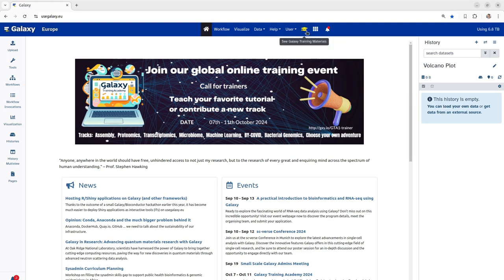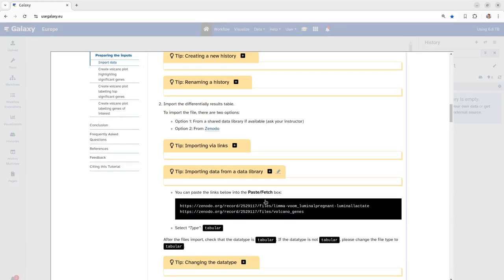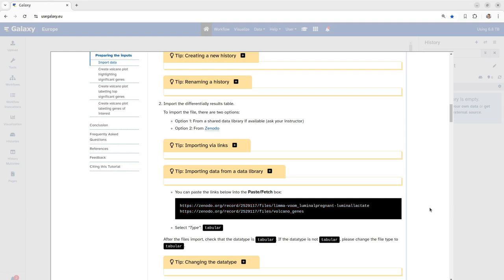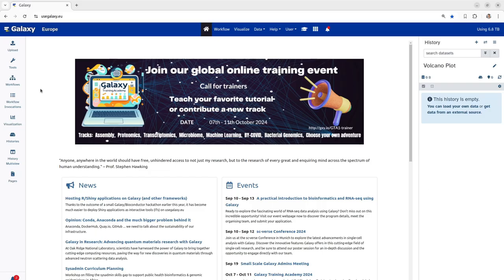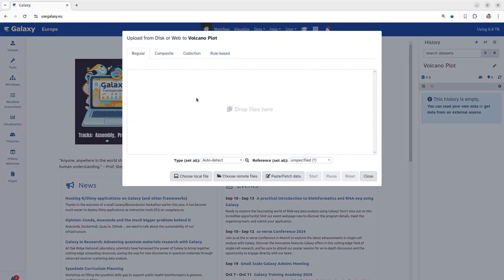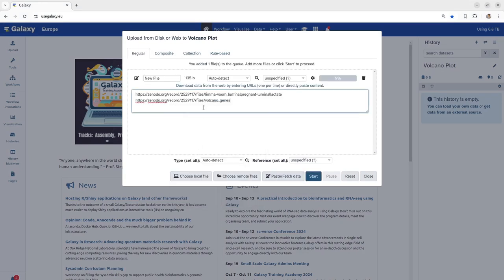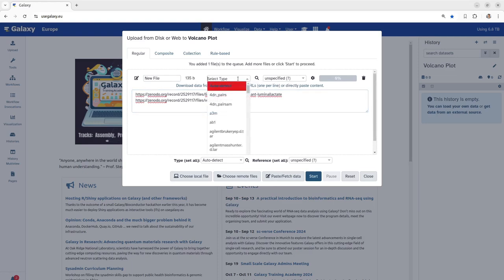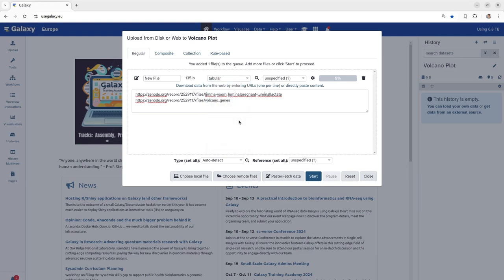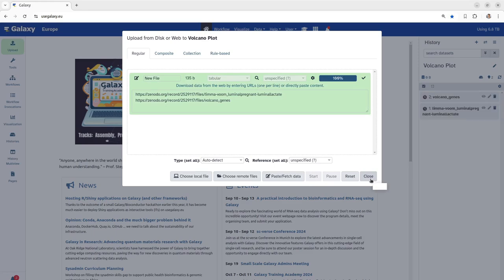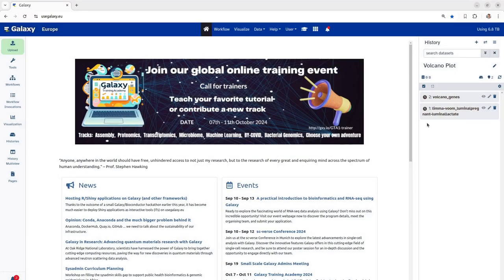To do so, we will import this file using the two given links. We will copy these links. These files are currently present on a remote server or in Zenodo. Once we copy this, we would click on the upload button. Once we click on the upload button, we will click on paste and fetch data and we will paste the links here. An important thing to note here is we have to select the type of this file as tabular to avoid any further error in our analysis. Once we have done this, we click on the button start and then the files are imported into our history.